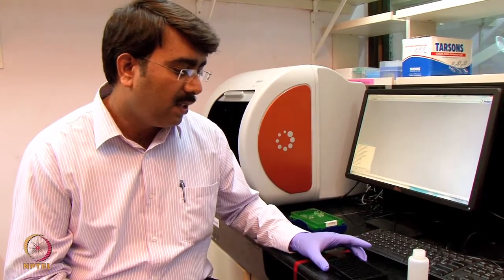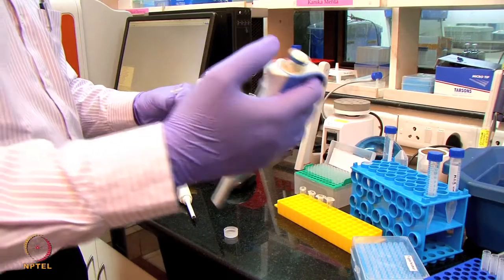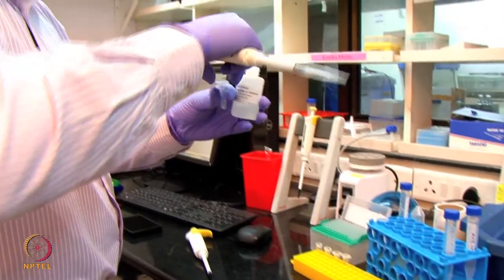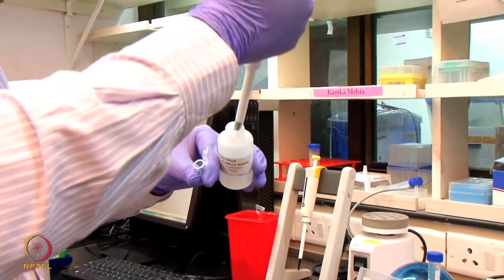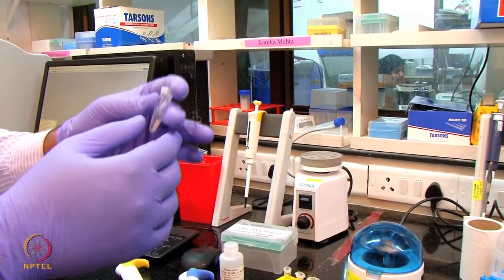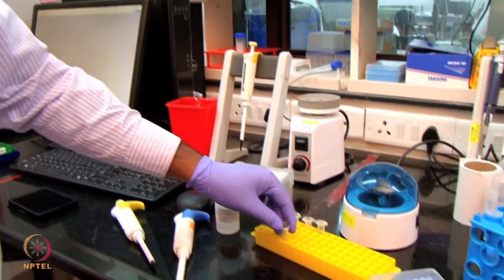We are going to do a quantitation of the apolipoprotein. In the previous step, we immobilized the biotinylated antibody onto the streptavidin sensor. Now we can do the quantitation using those sensors. It's pre-immobilized. So I am making an apolipoprotein standard with a concentration of 50 microgram per ml. I'm going to dilute it to 50 microgram per ml using the sample diluent. From this I'm going to do a serial dilution, a two-fold dilution with the buffer.